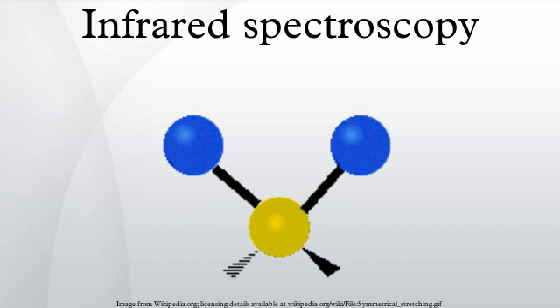Comparing to a reference. To take the infrared spectrum of a sample, it is necessary to measure both the sample and a reference. This is because each measurement is affected by not only the light absorption properties of the sample, but also the properties of the instrument. The reference measurement makes it possible to eliminate the instrument influence. Mathematically, the sample transmission spectrum is divided by the reference transmission spectrum.